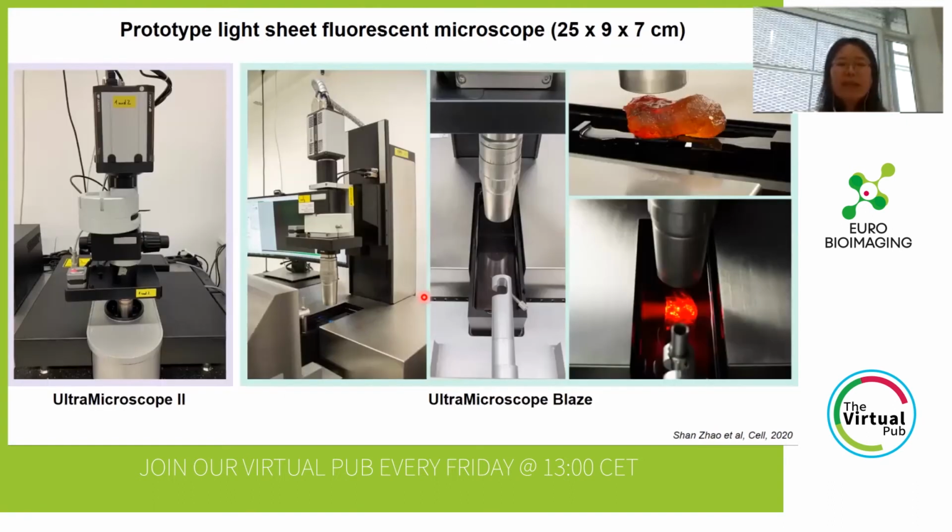So the next problem we were thinking about is how to image very large human organs. We know that the commercialized microscopes, for example the Ultramicroscope 2, have a very fixed and small sample chamber. Obviously, we cannot put the human organs inside, so we cannot image them.